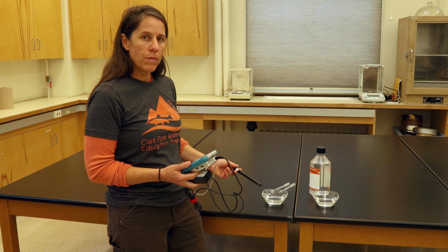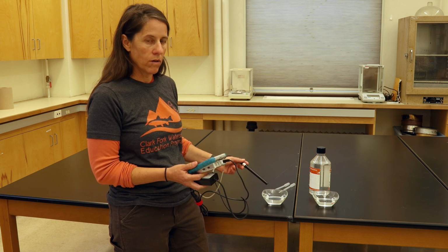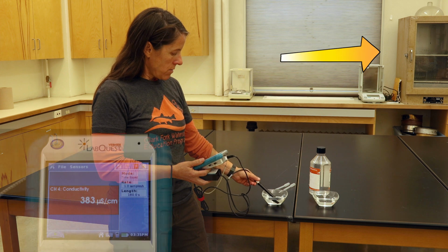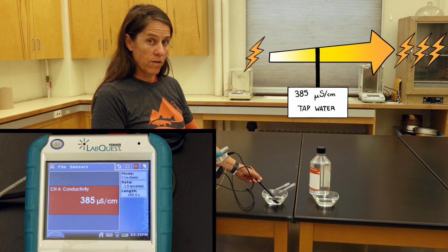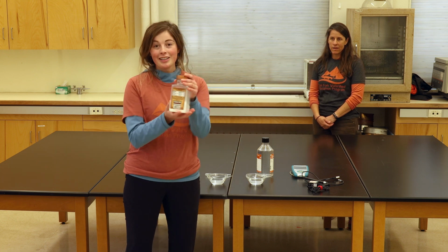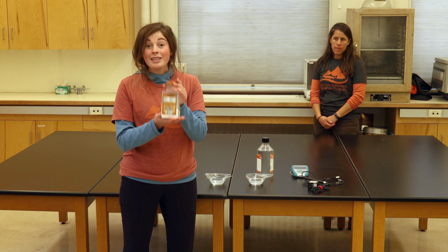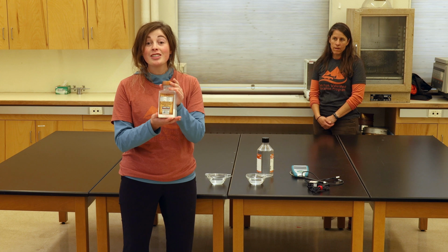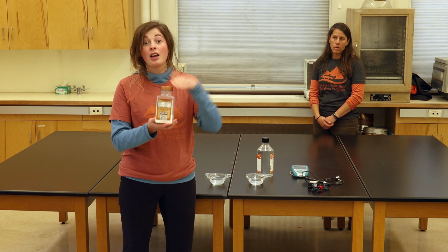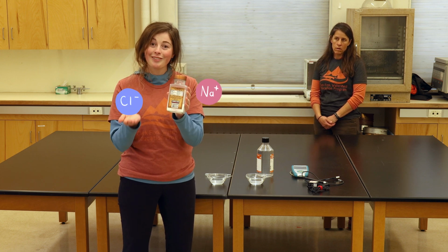So now let's measure the conductivity of tap water. If you guys recall, we do have some ions in there because we have some dissolved minerals. We have 385 microsiemens per centimeter, so higher than the distilled water. We're going to also be taking a look at a third clear solution with table salt in it. Here is a jar of table salt, and it's also known as sodium chloride. When table salt dissolves in water, it turns into its two separate ions, a single sodium, or a positive ion, and a single chloride, a negative ion.